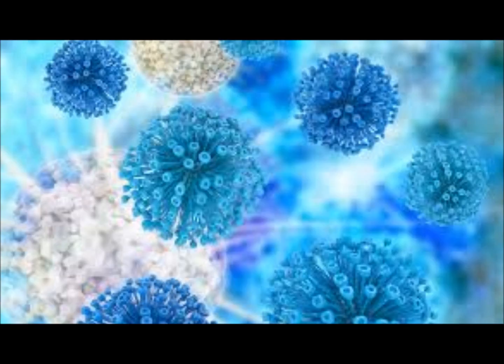So what you've got to do, if you read, the goal is a good sputum is less than 10 epis under low power, and greater than 25 white cells under low power. That is a good sputum. Then you know you didn't have all saliva. So that is something they're going to expect you to be aware of when you go to clinicals.